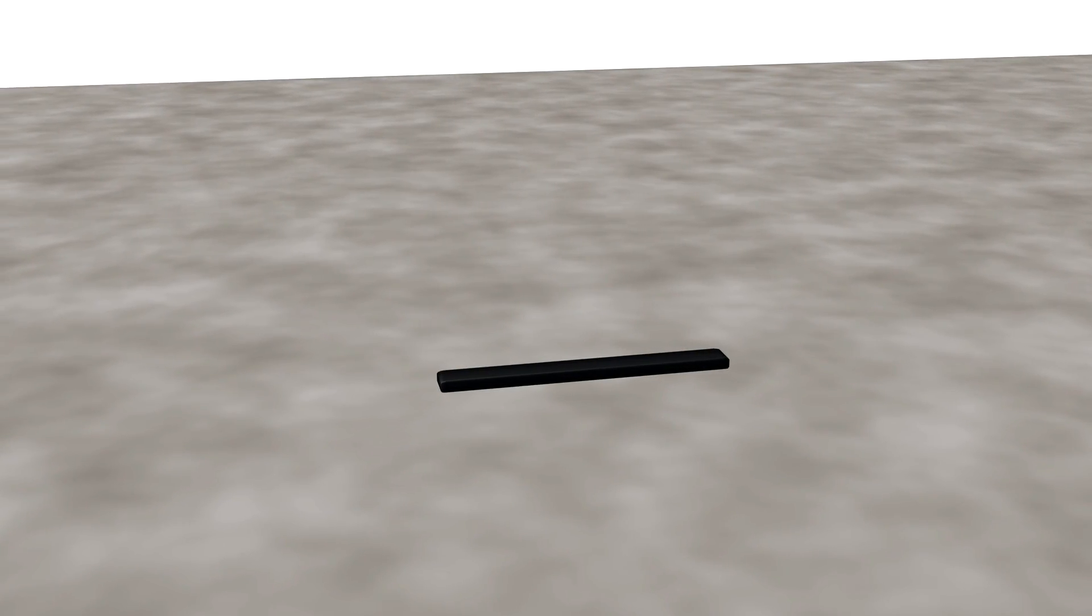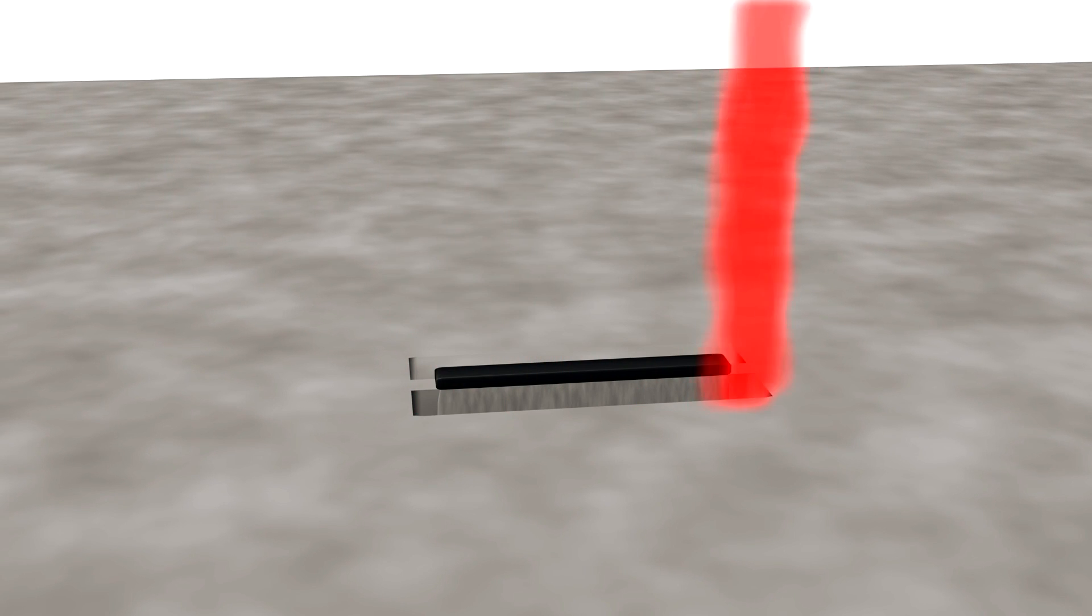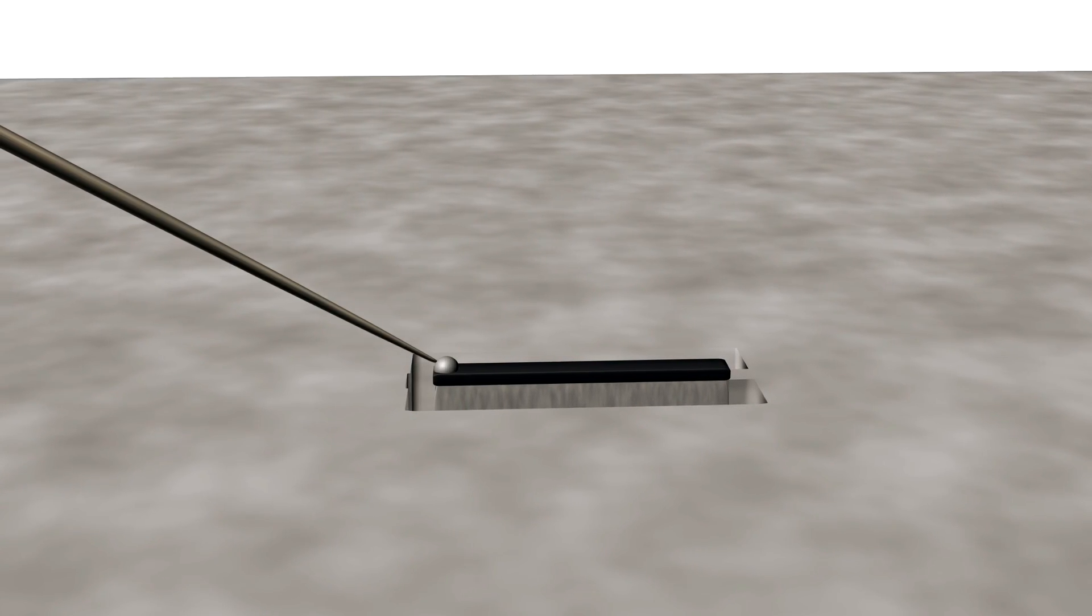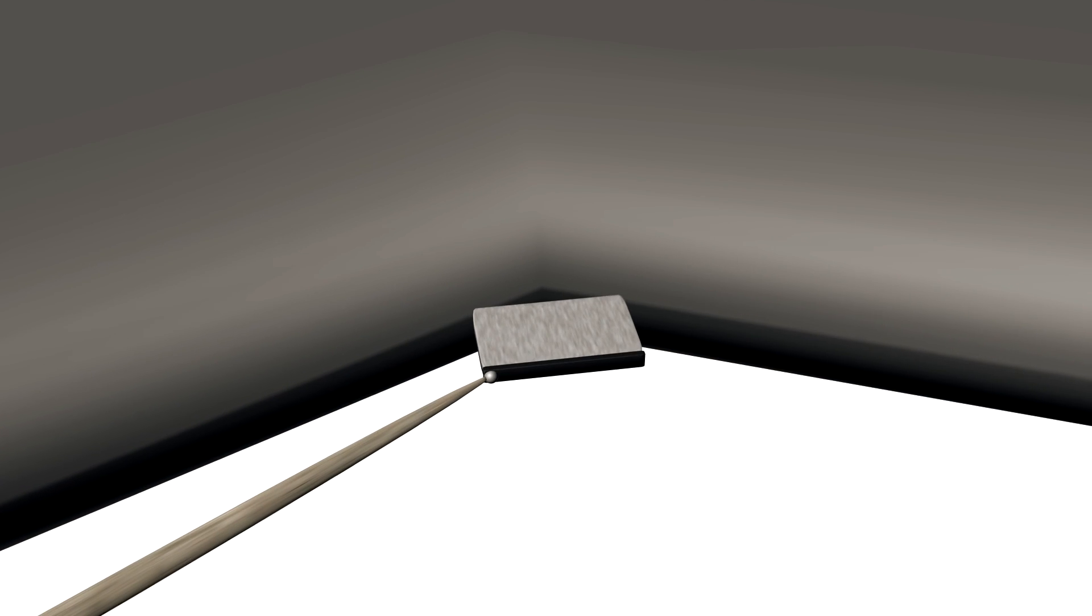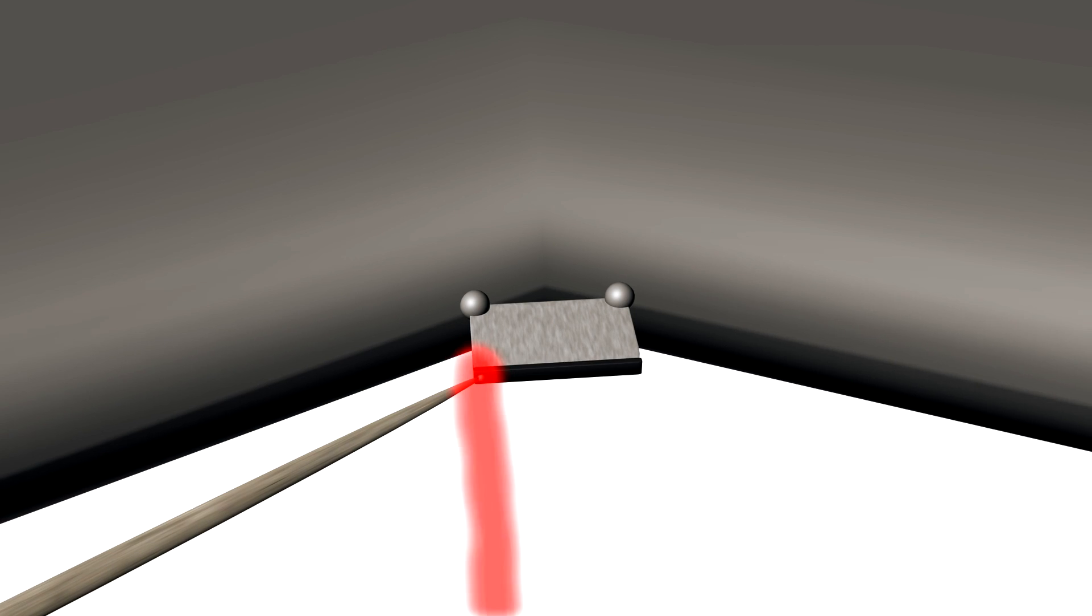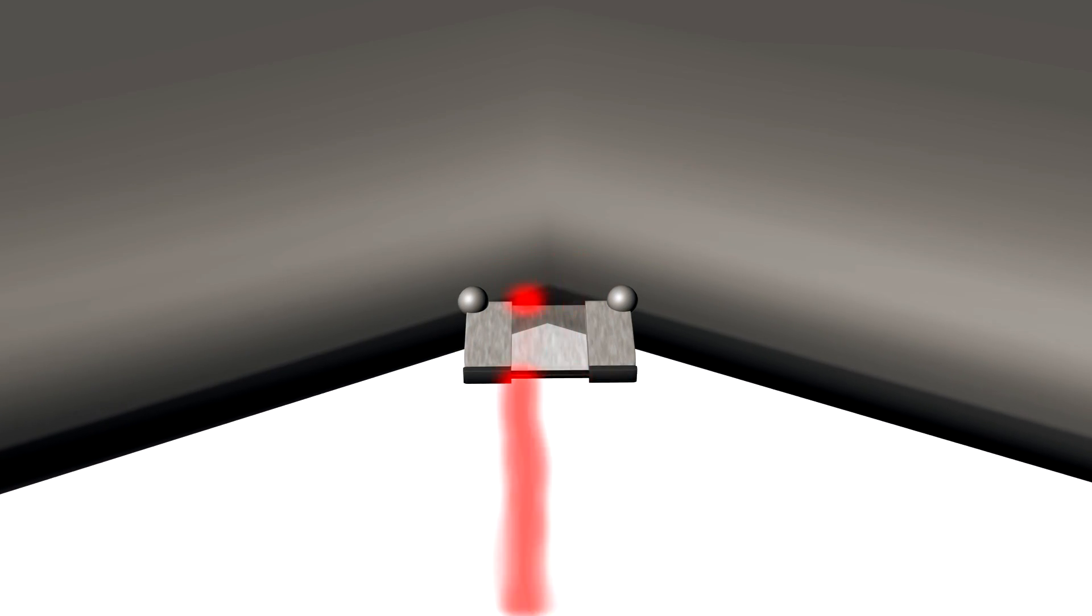For that purpose, a thin lamella is cut out of the sample with the focused ion beam and extracted carefully with a nano-manipulator. Once the lamella is attached to a special holder and thinned even further, it can be studied under the transmission electron microscope.